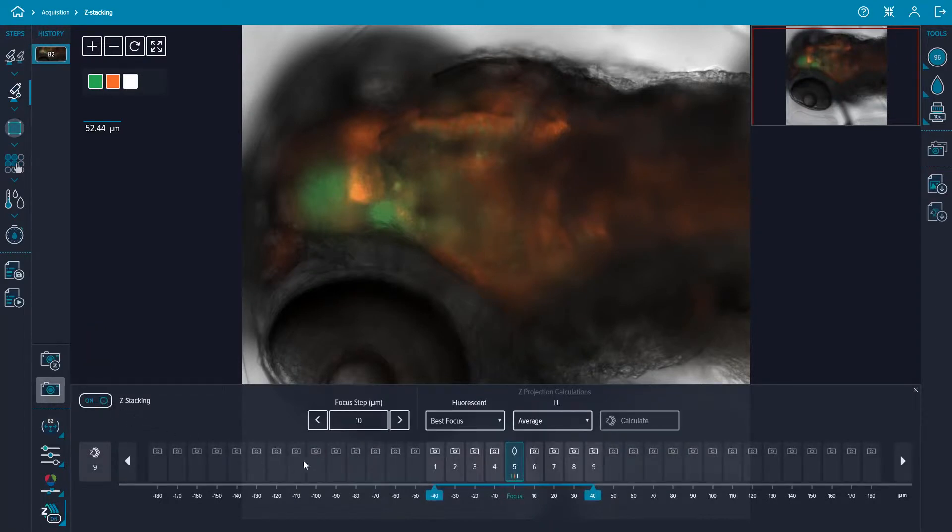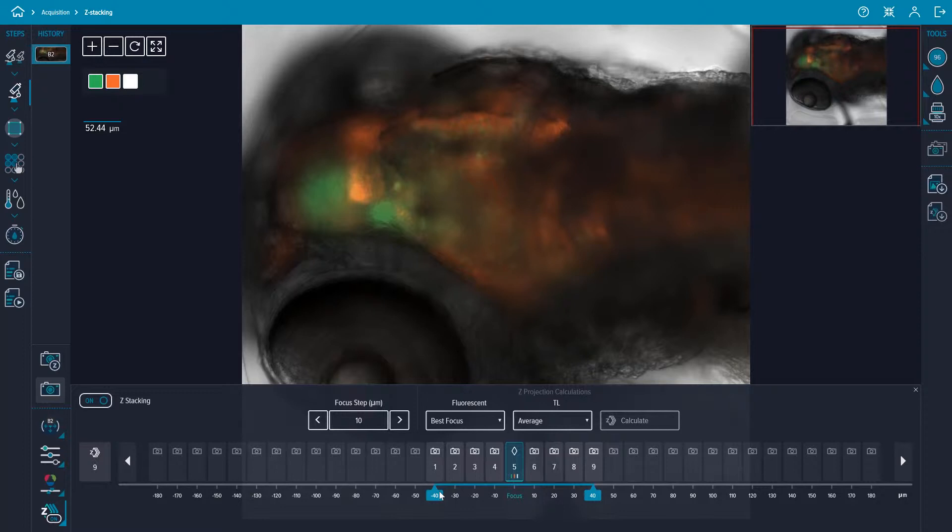The recommended focus step, the distance between planes in the z-stack, is automatically generated for each objective and is determined by the depth of field of the objective. If desired, the focus step value can be changed manually.